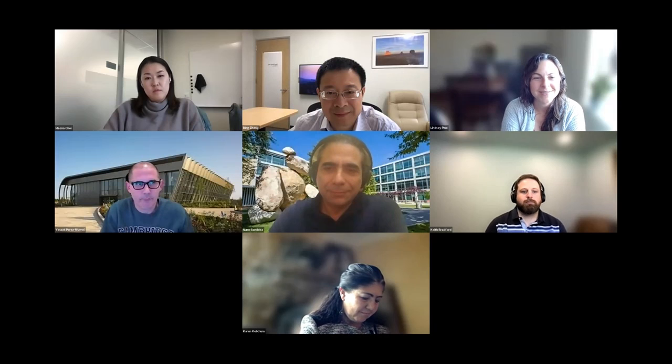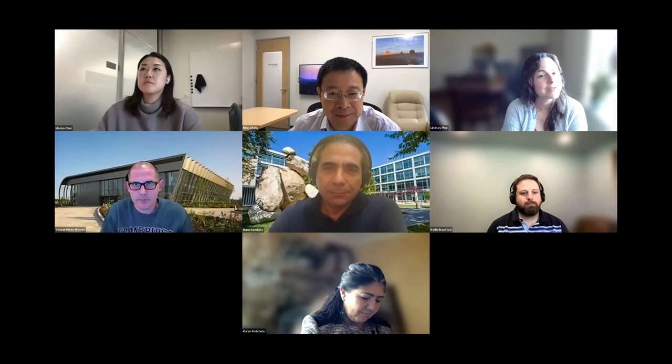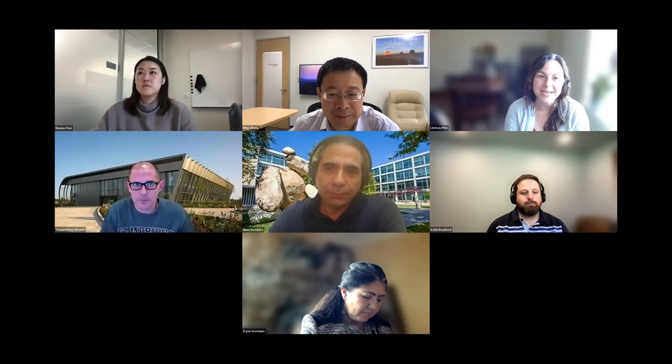Yeah, I love it. And Nuno's posed a question to everyone. We have just a couple more minutes left. The thought he's going to end with is, what is the main thing you wish repositories could do for you that can't be done today? So, looking forward, the future of repositories. We discussed a lot of different things: adding metadata so we can better combine different experiments, quantitative or otherwise, like spectral libraries. We talked a lot about how to reuse data that might be in these repositories, which seems like maybe one of the main things that users wish they could do that they can't easily do right now.